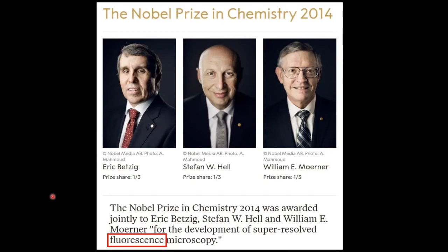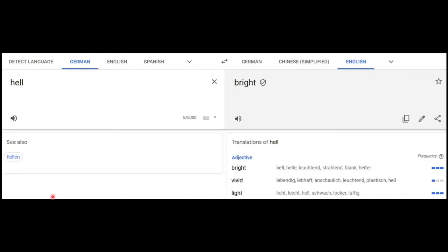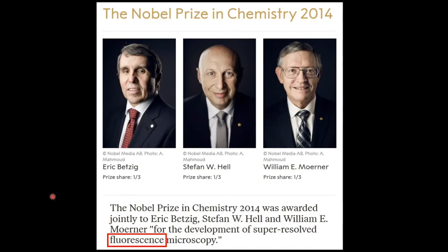The traditional techniques, for example bright field and DIC, are still covered by the diffraction limit, or Abbe's limitation, which is about 200 nanometers. Only fluorescence, using different tricks, can go beyond the diffraction limit of 200 nanometers. So let's go over the most popular super resolution techniques. Also, I was curious about this person's name, Stefan Hell, right? In English, we all know the meaning of that. But actually he's German, and actually Romanian.